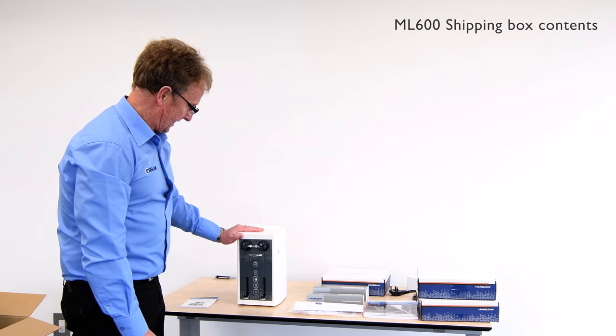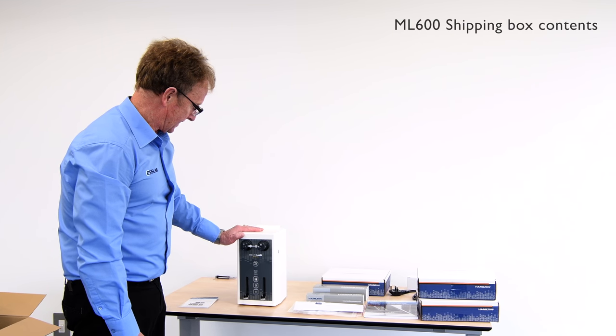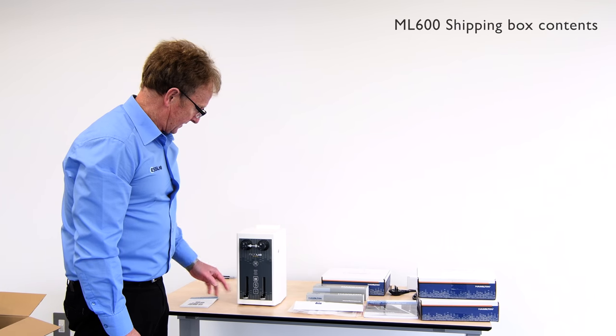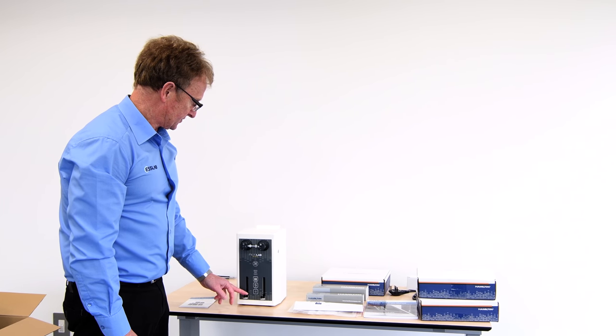So here we have the instrument. First of all we need to connect the power supply and then introduce the syringes into the syringe drives and the valves.